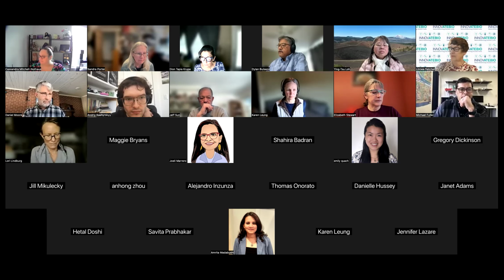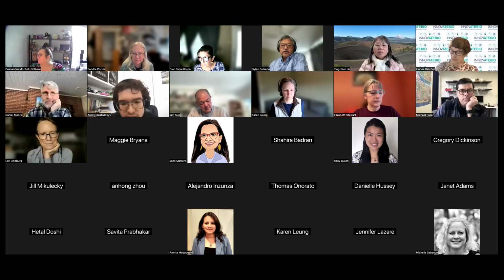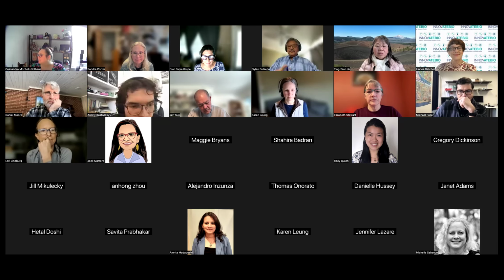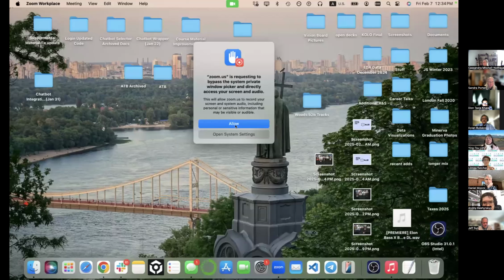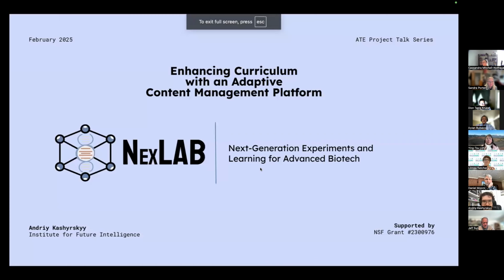As part of that, we've developed a software platform that includes an electronic lab notebook and content management. Andriy will tell you more about that platform called NexLAB. So I'll just turn it over to Andriy and let him take it from here. Okay, hello everyone. I will share my screen in just a minute. Can everyone see my screen? Yes. Okay, let me start the slideshow.